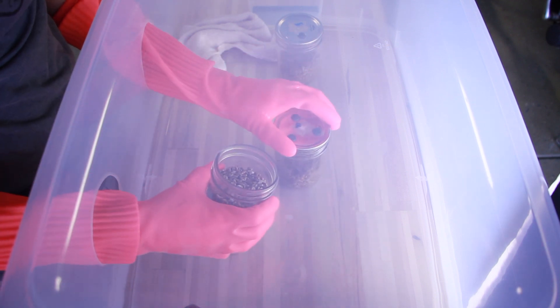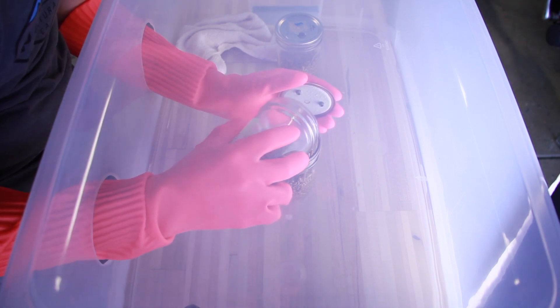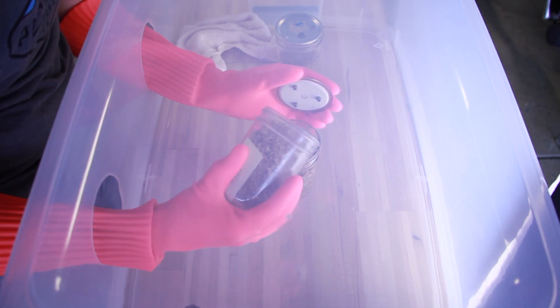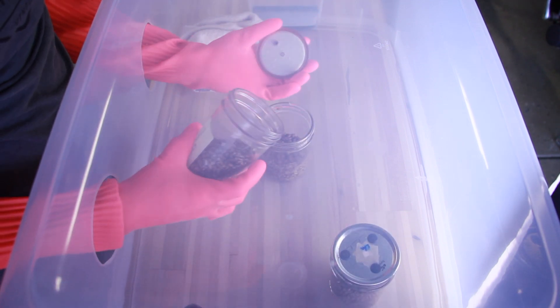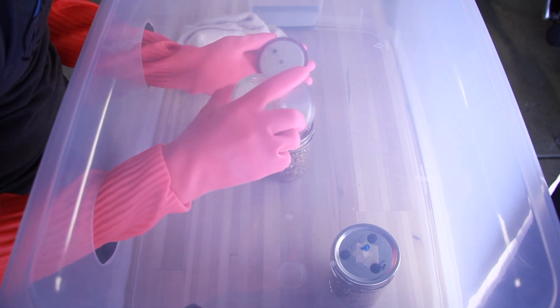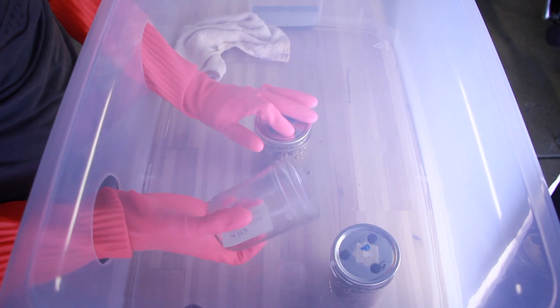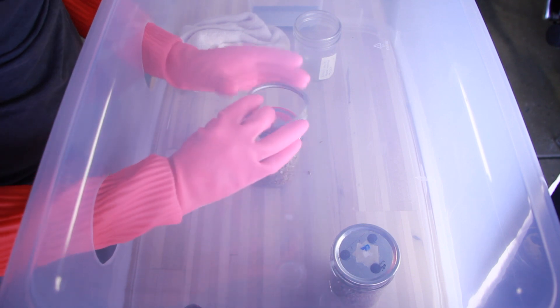I'll be splitting this one colonized jar between the two jars of receiving grain. You'll notice that the lids I have have injection ports on them - these just happen to be the lids I had laying around, so the injection ports are really kind of useless for what I'm doing here. All I'm really doing is colonizing some more grain.